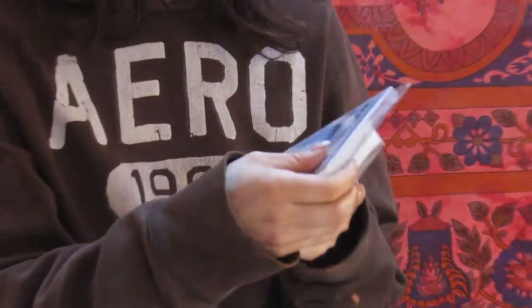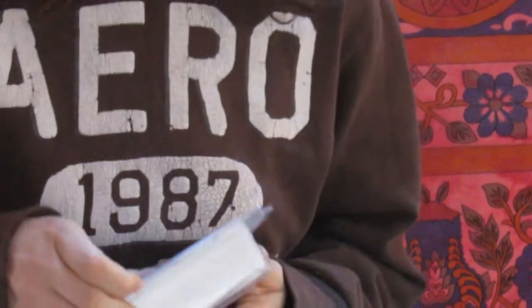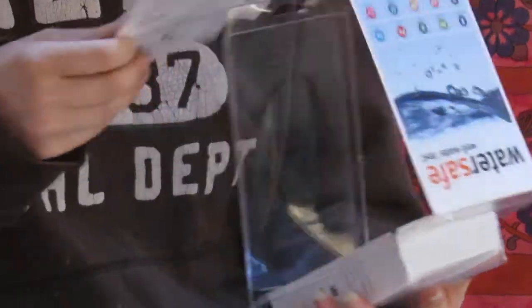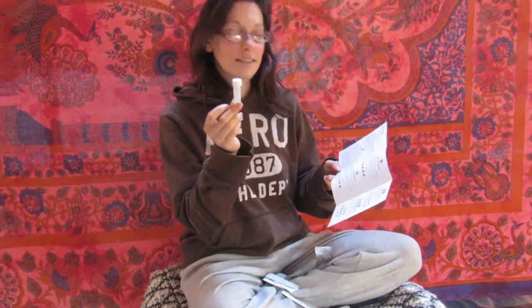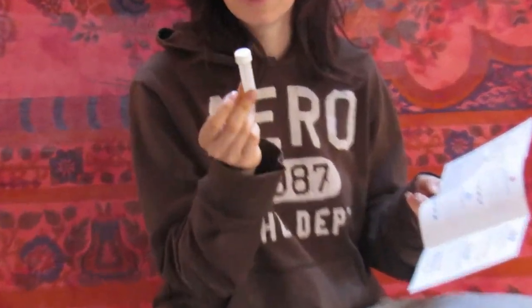Here we are with the WaterSafe Well Water Test. Let's see what's inside. It checks for several different things. We got a test for pesticides and lead. This is the bacteria test. This one you have to keep for 48 hours between 70 and 90 degrees to get the results.